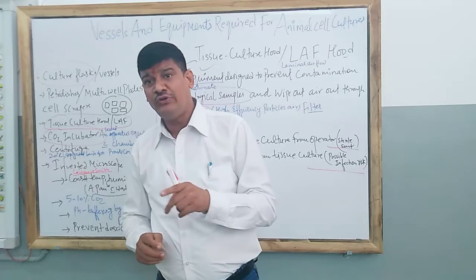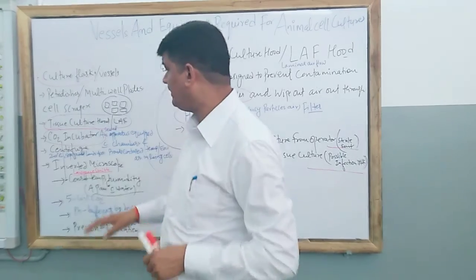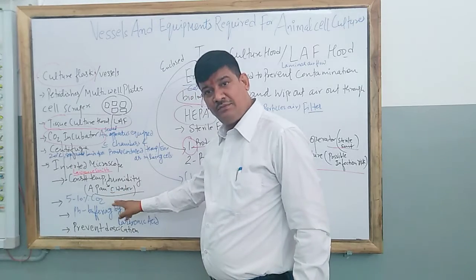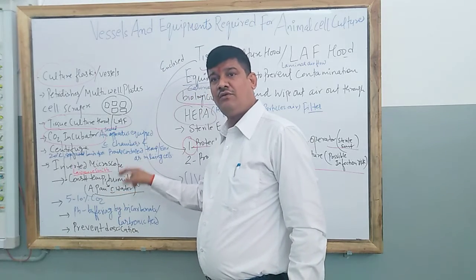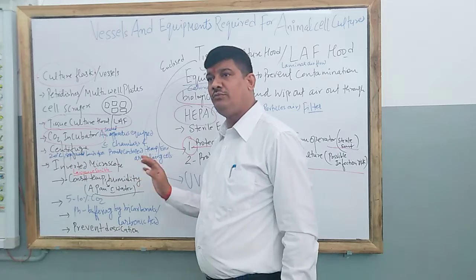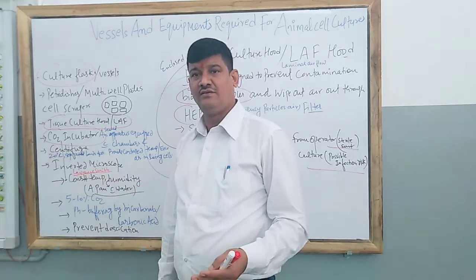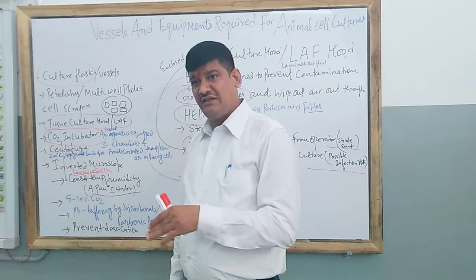If there is a lack of humidity, what happens? There is desiccation. So the main purpose of keeping a pan of water in the incubator or CO2 incubator is that it prevents desiccation. Desiccation means dryness to the cultured cells.